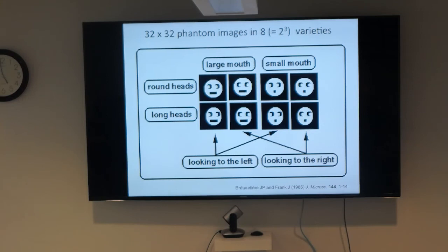and this is one of the software developments which is really very important, which is to create a modeling environment which follows these changes in resolution without any jumps, but rather in a continuous way.